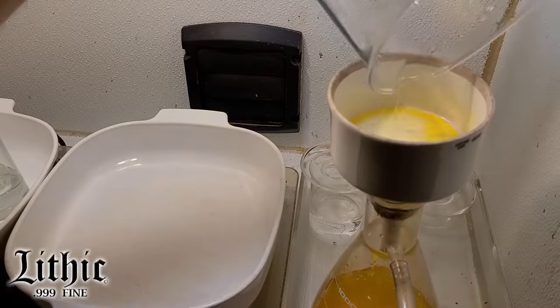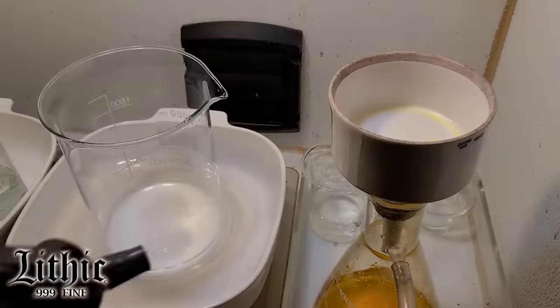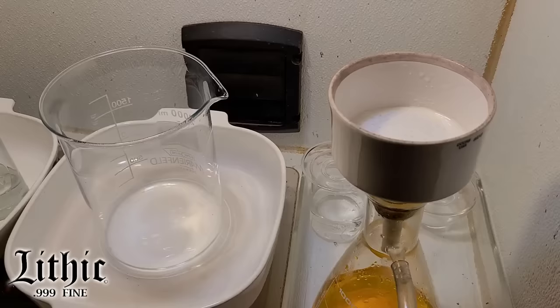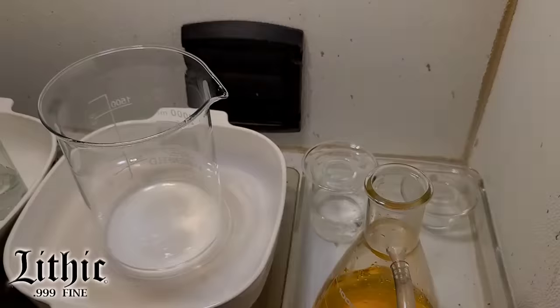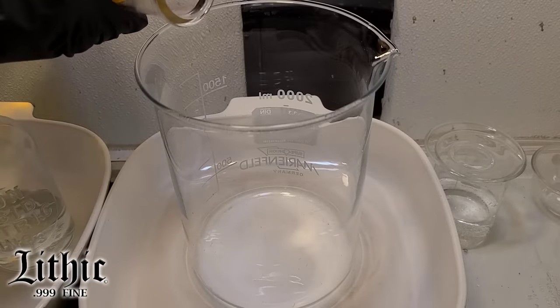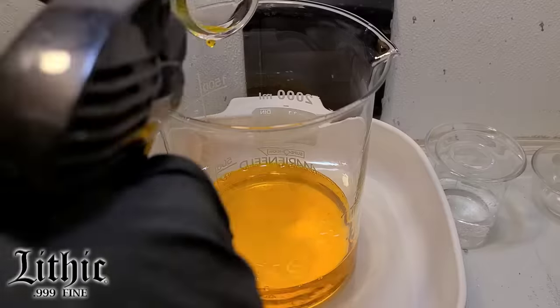I'm filtering the material just in case I need to collect any little particulates in there. I did add some sulfuric acid, so if any lead was in there it would have dropped out, and I'm collecting it in that filter. I don't think there's any lead in there. So here we have some pretty clean stuff and it's looking good.